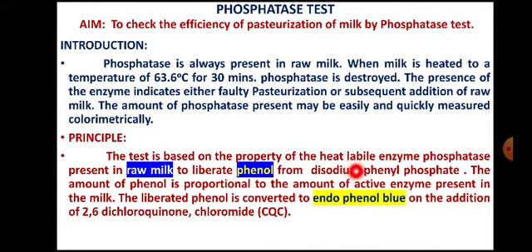Then there is formation of enzyme product complex. Enzyme separates from product. So here the substrate for phosphatase enzyme used in this test is disodium phenyl phosphate.